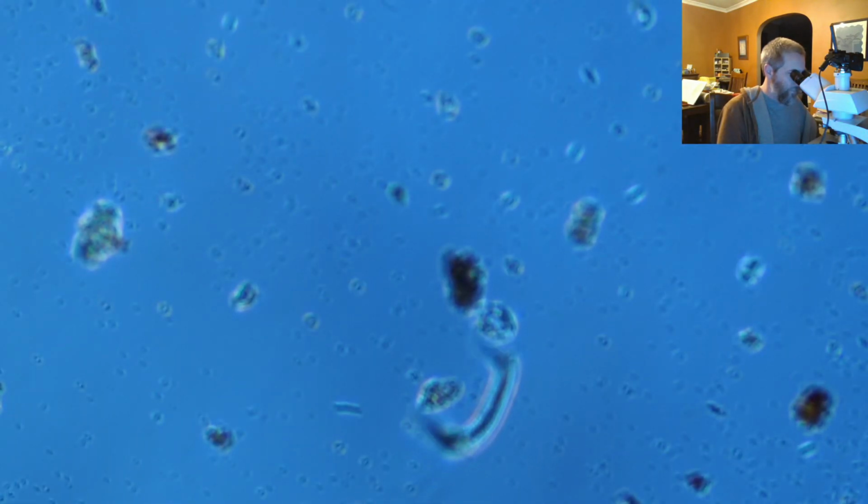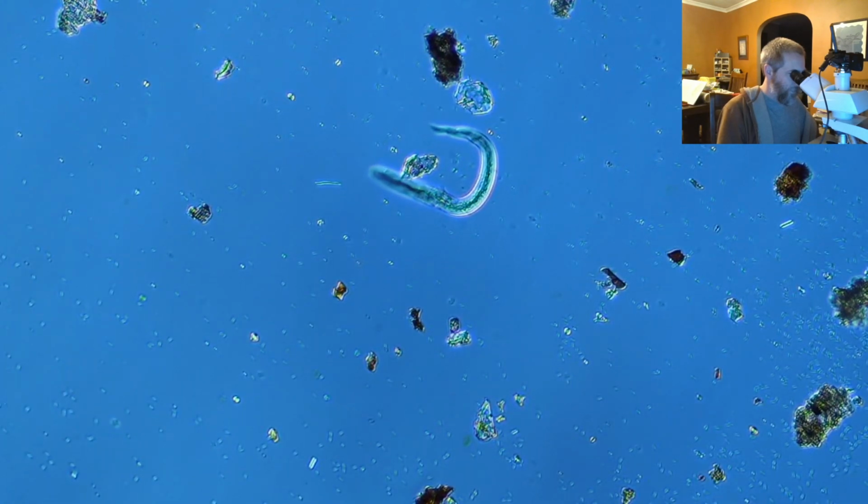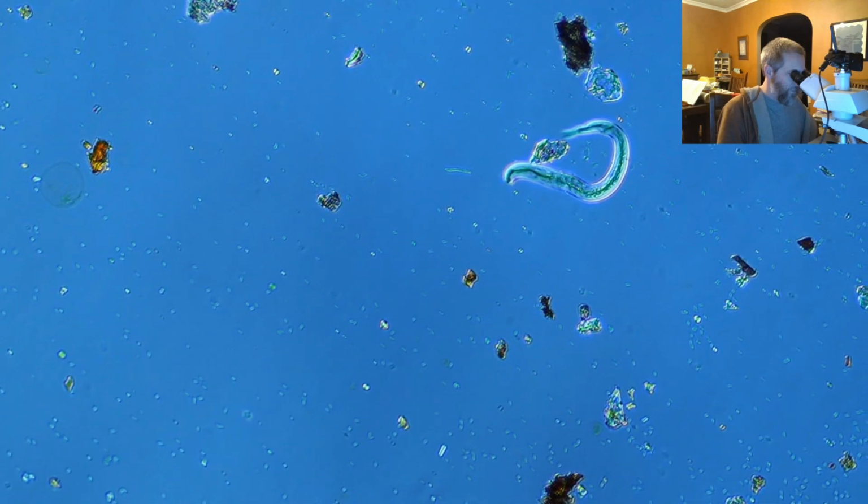A cool thing about a lot of the metazoans, the tiny animals, is that a lot of them are transparent, or translucent at least, and so you can see what they've been eating, which is kind of cool. It gives you a really good sense of what they've been up to. There's a little slow-moving nematode worm.